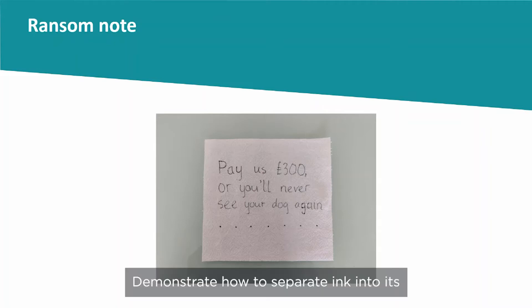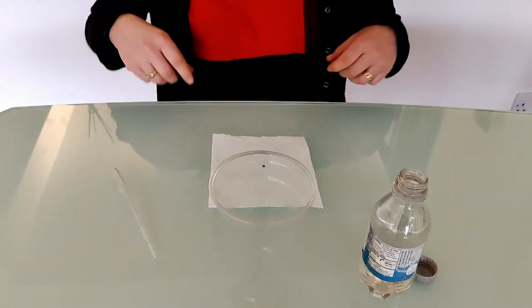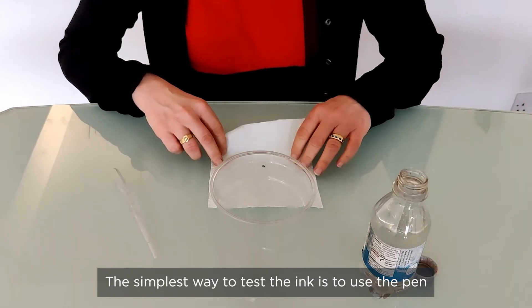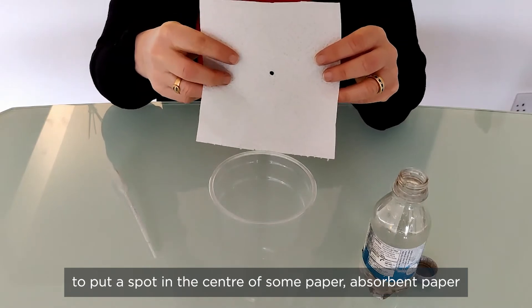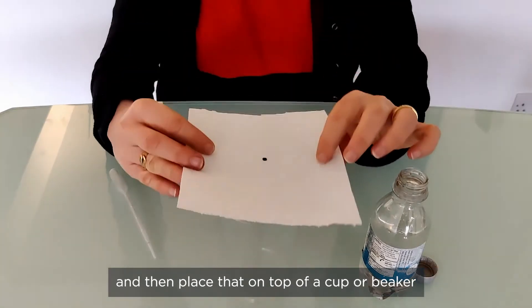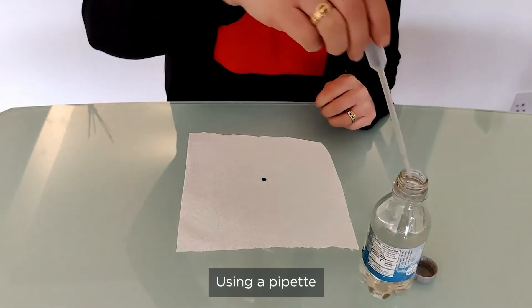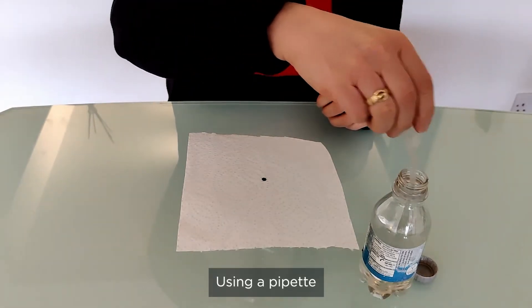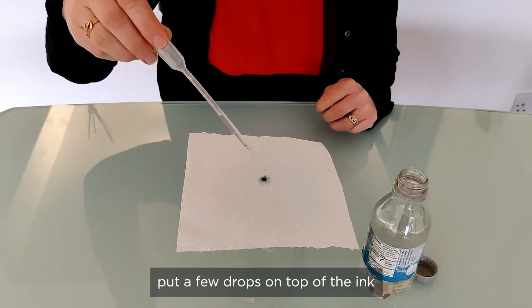Demonstrate how to separate ink into its component colors using chromatography. The simplest way to test the ink is to use the pen to put a spot in the center of some absorbent paper, then place that on top of a cup or beaker. Using a pipette, put a few drops of water on top of the ink.